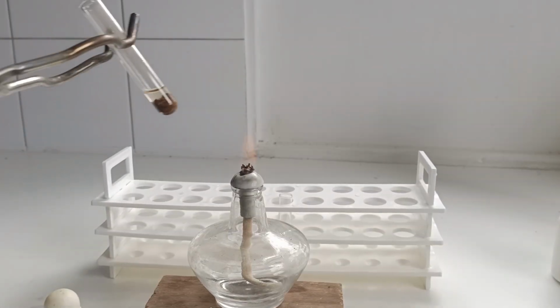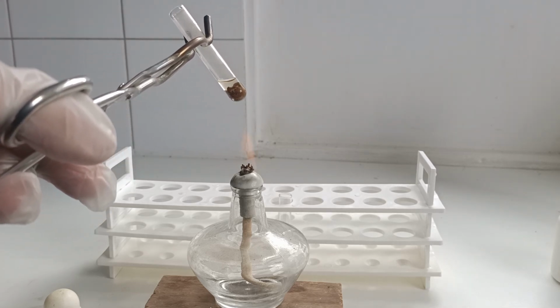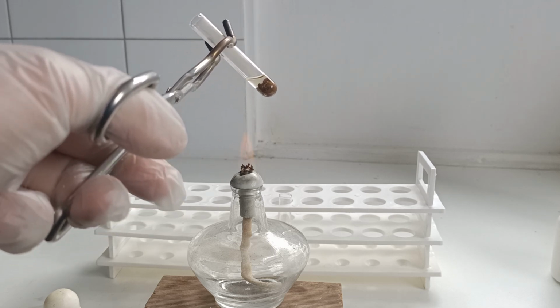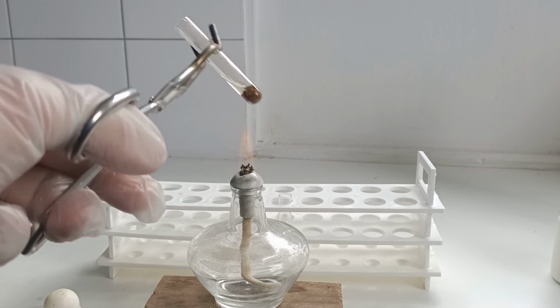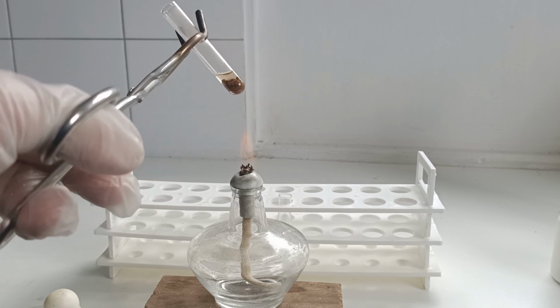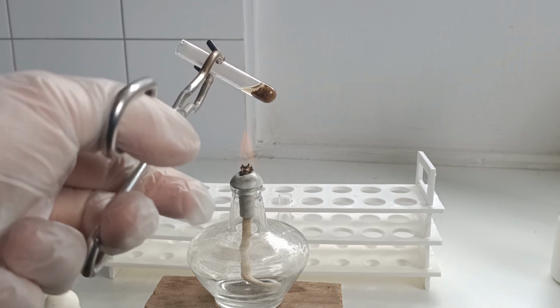Okay, this is the scary bit. Boil it up a little bit carefully. So you want to use decent quality test tubes for this. Now, nitric acid is dangerous to handle. I would not recommend this unless you're familiar with using dangerous acids. Boiling nitric acid is not a friendly chemical.